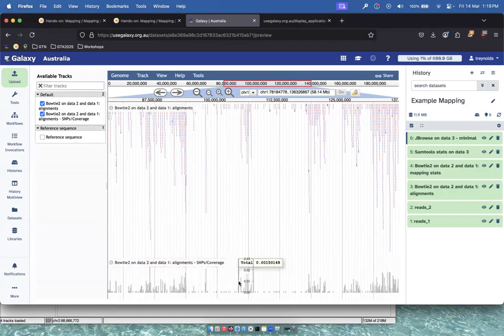And we can now see, in addition to having the actual alignments in the upper part of the viewing window, we also now have the coverage shown at the bottom, which as we saw previously in IGV, is fairly low due to the small data sets we are working with, which allows for the processing for the tutorial to be faster than an actual real data set would be.